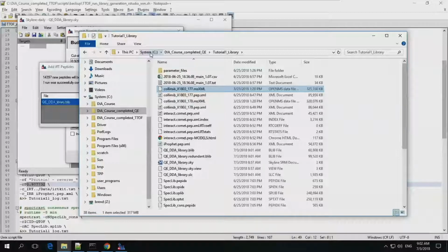There are some search engines that don't require this. So Mascot puts the spectra right in the .dat files, and a fair number of them, .group files from ProteinPilot, and X!Tandem do too. But for some you actually have to have these spectrum files in order for Skyline to get them. Is everybody through that? Anybody need more time? All right.